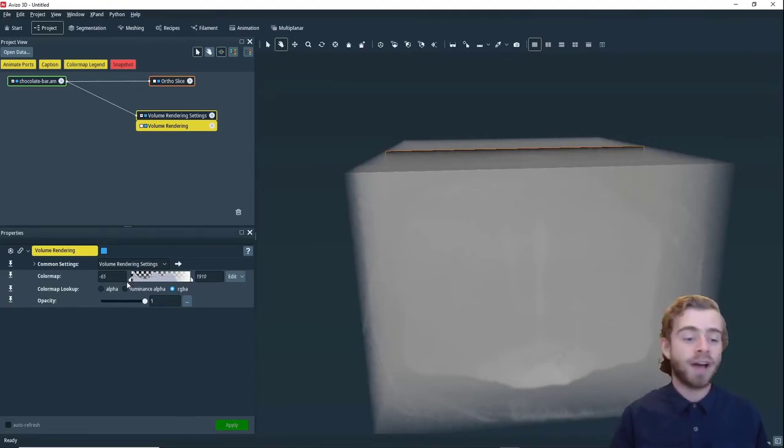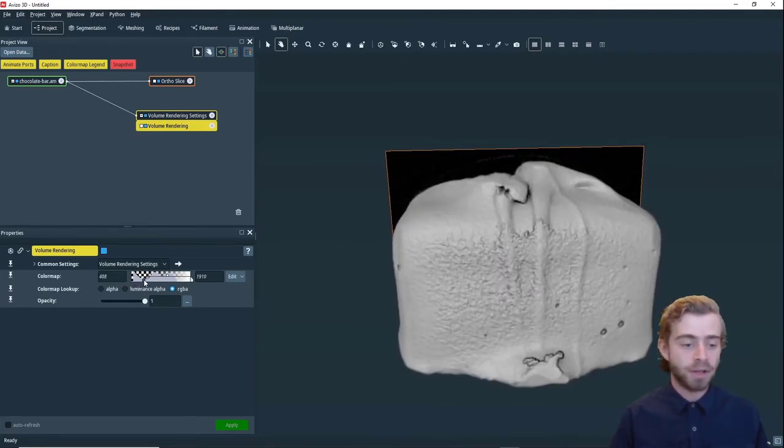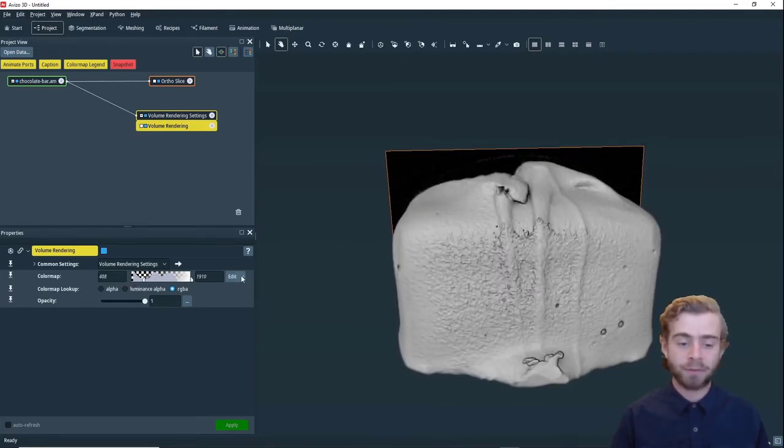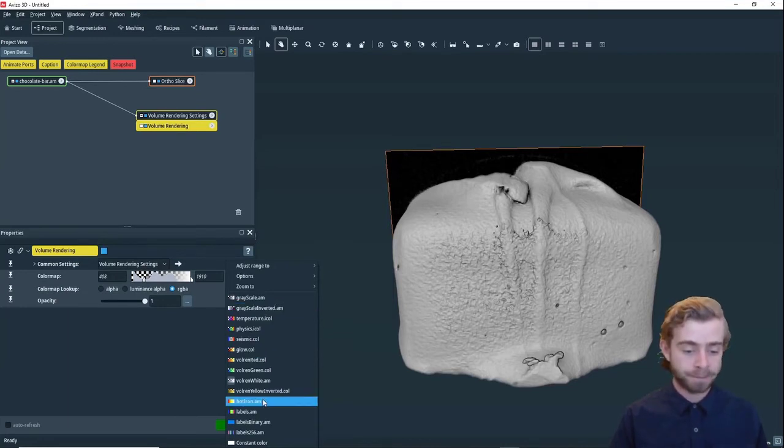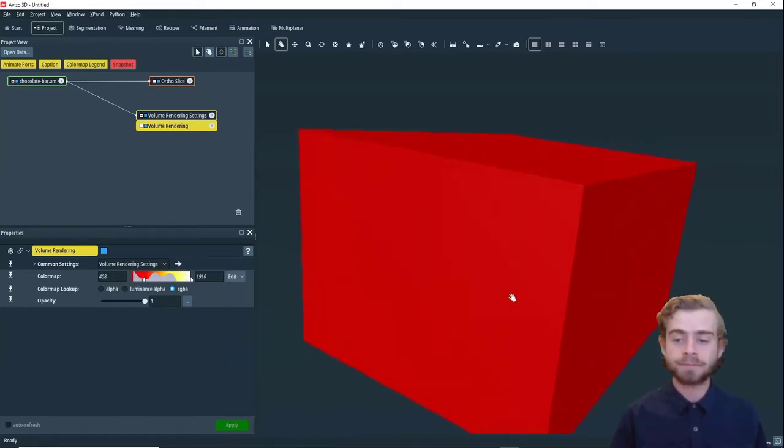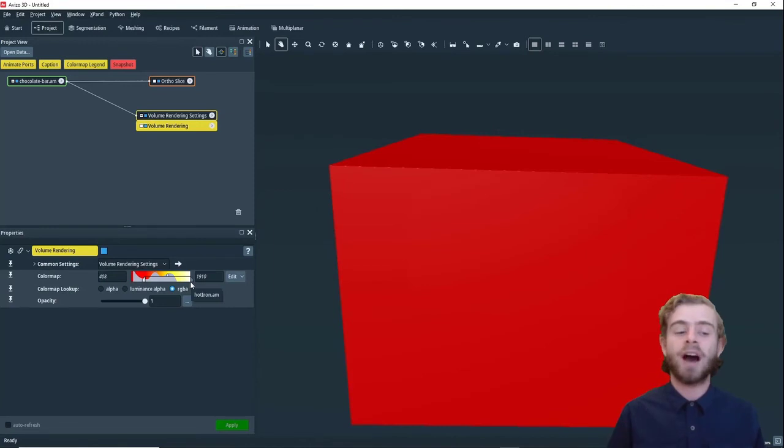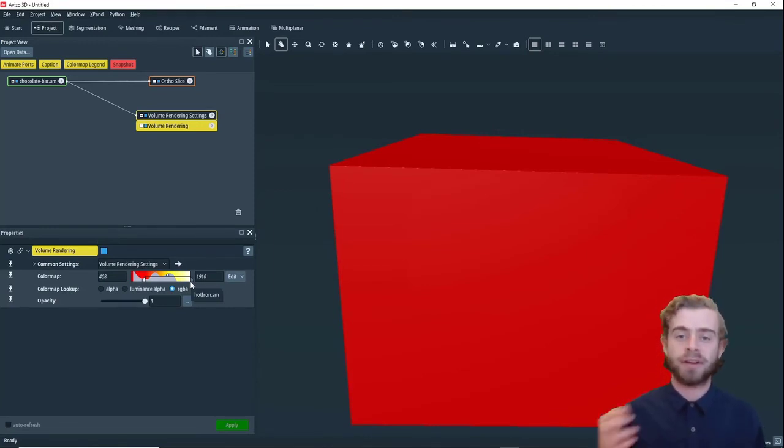So this is not the case with all color maps. So if we change this back to 408, but instead choose hot iron, we can see that hot iron has no transparency whatsoever. So all the pixels are rendered as fully opaque.